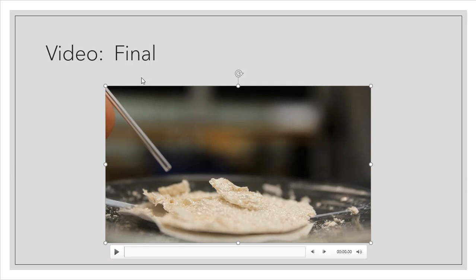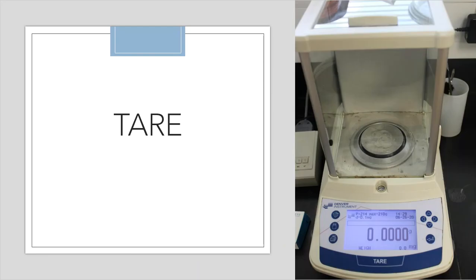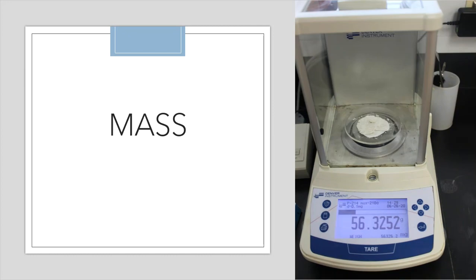All right, so there's the observations of the recrystallized product at this point. I do know I need a weight, so I went back to the balance. I tared out the balance, 0.0000, just like always. And then I take that watch glass with the filter paper and the product onto that balance, and I get a weight of 56.3252. So keep in mind, that is the mass of the watch glass, that is the mass of the filter paper, and that's the mass of my product. So how do we get the mass of the product? That's what we're after, and that's what you need to do and find out.